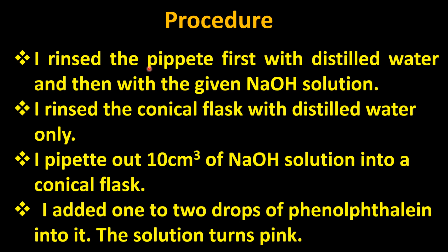So I rinsed the pipette first with distilled water and then with the given sodium hydroxide solution. Then I rinsed the conical flask with distilled water so that it can easily be dried out and I can easily take my solution in it.